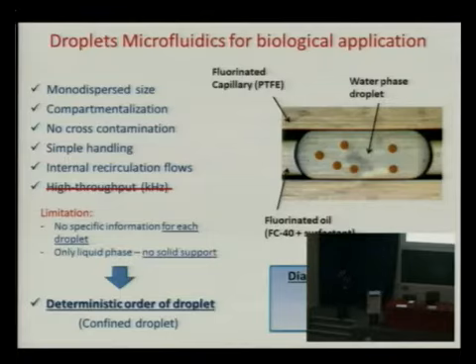We cannot work with our technology at really high throughput, at kilohertz. We are more in the hertz rate. But we think that this kind of approach can be really interesting for diagnostic application. And in particular, here I'm showing you our platform for the RT-PCR application.